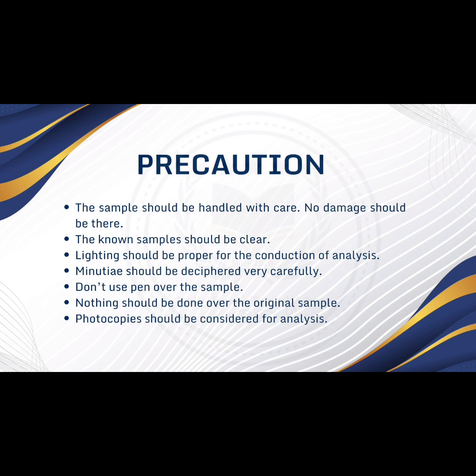We should not use any pen over the sample, or do anything directly to the original sample, as we should first take a photocopy, photograph it, and then proceed with the analysis process. Lastly, the original sample should not be tampered with or contaminated in any way, so that the analysis and examination are carried out without bias and in a more appropriate and precise way.